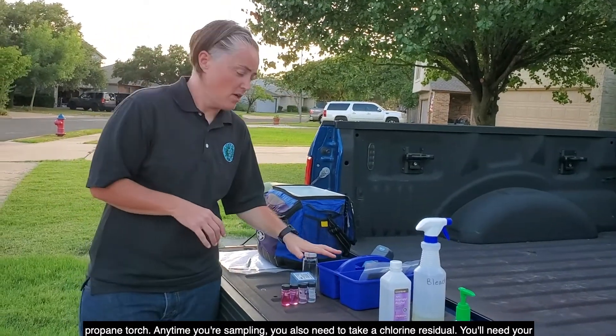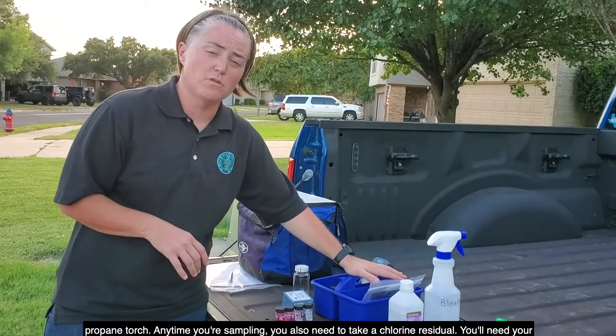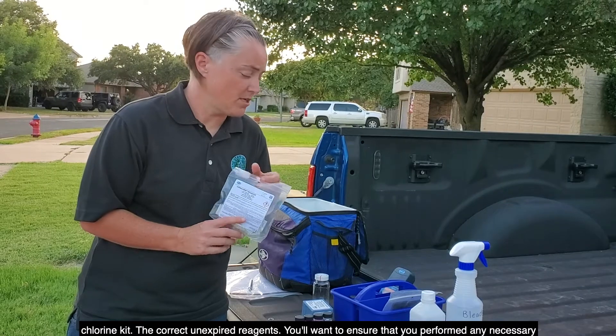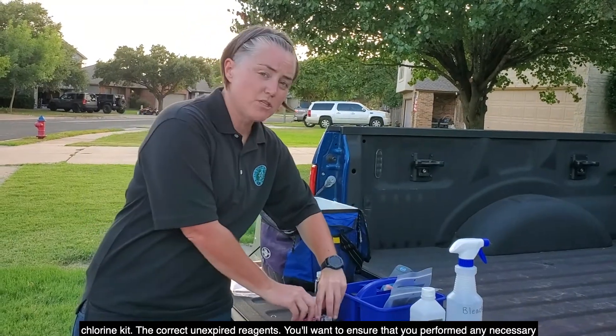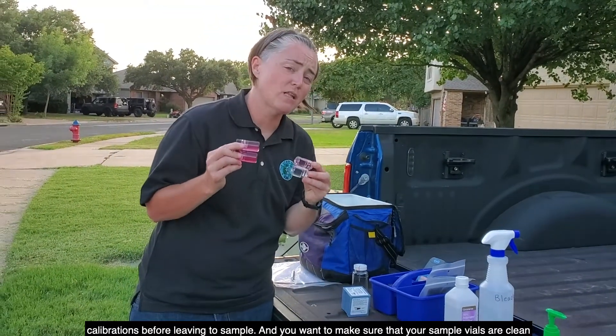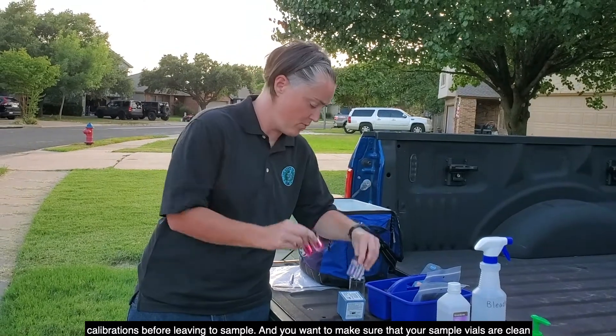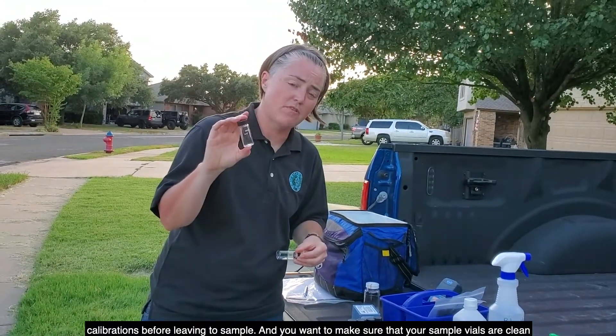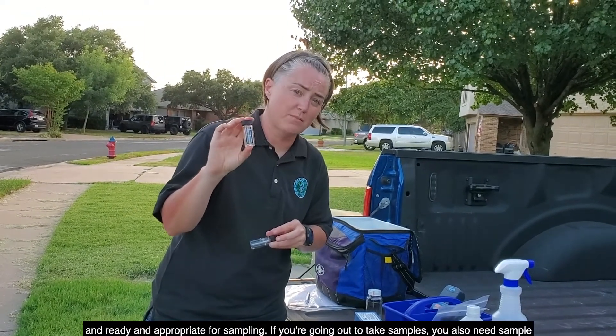Anytime you're sampling, you also need to take a chlorine residual. You'll need your chlorine kit and the correct unexpired reagents. You'll want to ensure that you've performed any necessary calibrations before leaving to sample, and you'll want to make sure that your sample vials are clean, ready, and appropriate for sampling.